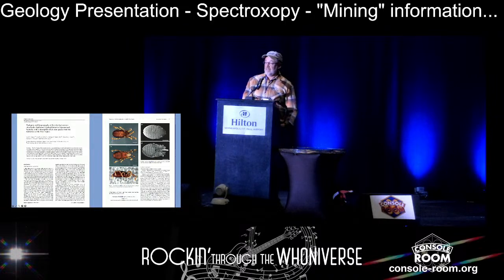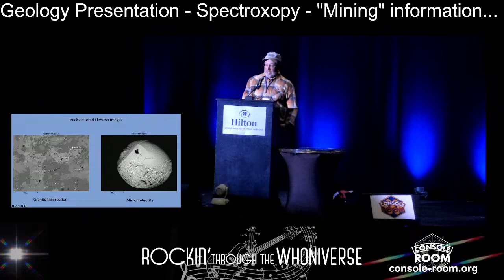Students have access to this. So if you're at an R1, University of Wisconsin, University of Minnesota, they have all this instrumentation and more, but undergraduate students are not going to be able to get to use it unless it's a really unique situation. Here, I can have them collect data in about 30 minutes. So some take advantage of it, some don't, but I encourage them. They have access to this stuff, which is quite unique. So moving on, I've got to keep an eye on the time here.